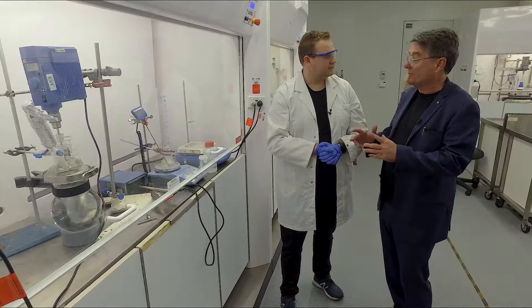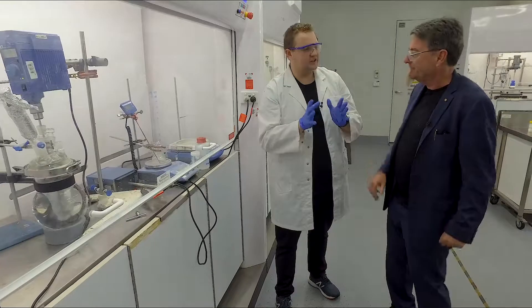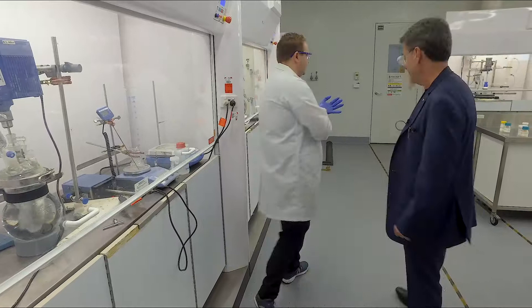So that's still quite large scale compared to what they would do in the research facility. Yeah, definitely. It's one step up. Research is about one gram. We're working towards 50 grams here. And now I'll take you to the reactors.